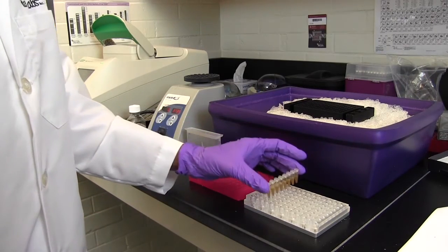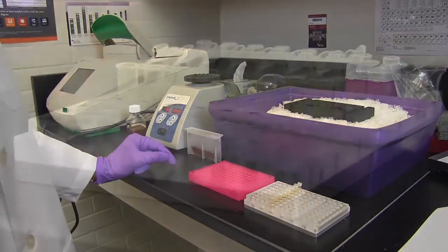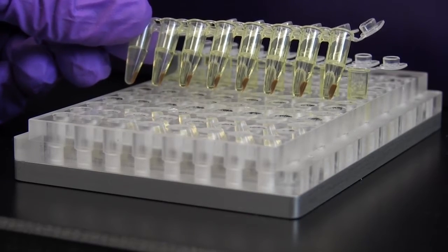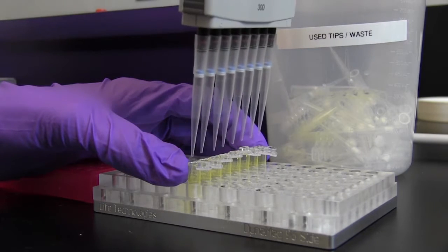Incubate for 5 minutes at room temperature, then place the reaction into the magnetic field. After approximately 5 minutes, the beads should have separated from the supernatant. Carefully remove the supernatant and avoid disturbing the pellet.